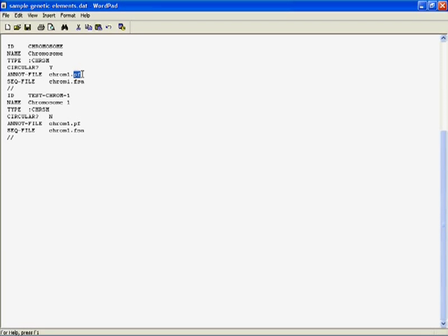And if you're wondering what PF is, it's our sort of homemade annotation format, pathologic format. And that's what we actually convert things into when we do our big BioCyc builds where we're doing 100 things at a time, because it lets us sort of pre-filter to make sure that we can actually parse all the stuff we're working with. But we don't need to worry about that now, and you don't need to worry about that when you're working at home. So it's just the GBK. And then FSA is one possible suffix for a FASTA file, but in our case they're called FNAs.